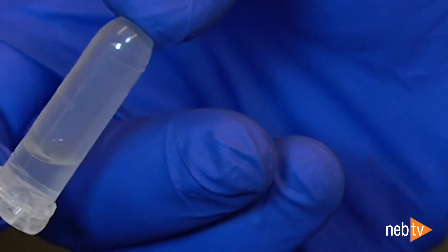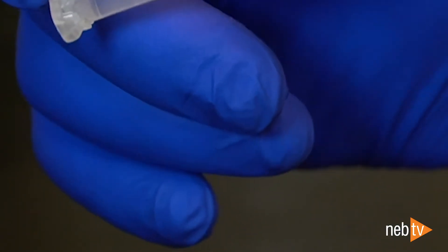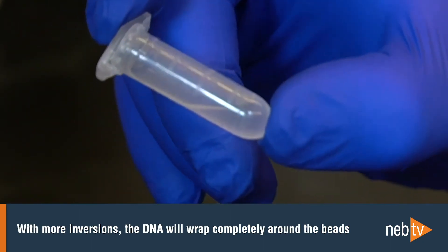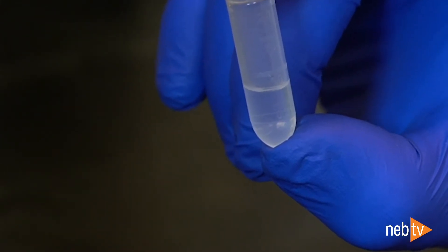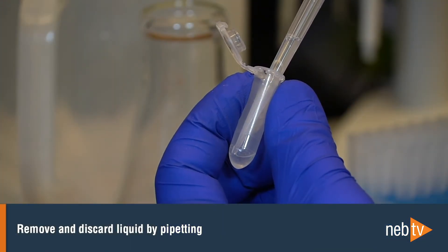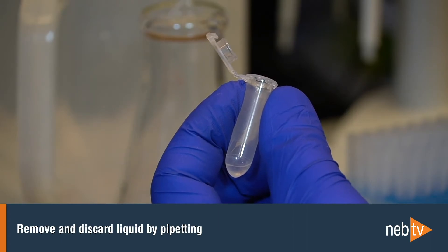During the following inversions, precipitation of DNA may be visible, especially with larger sample inputs. The DNA complex will often contain small air bubbles, and with more inversions the DNA will completely wrap around the beads, often causing them to stick together. Once the DNA is completely wrapped around the beads, the viscosity of the solution will drop back to normal levels. After the inversions are complete, remove and discard the liquid by pipetting, and there are two ways that you can do this.